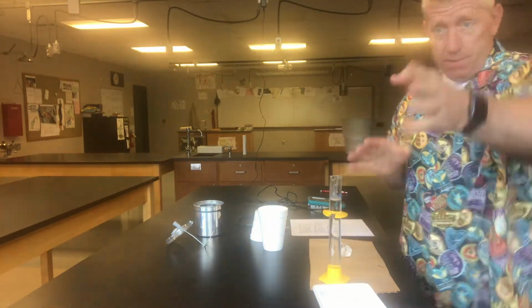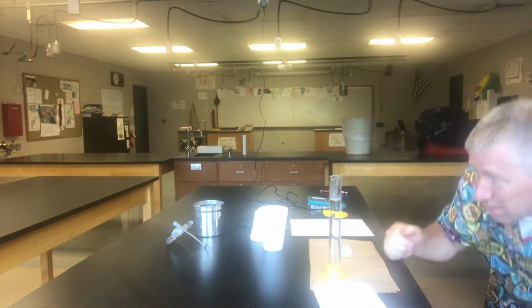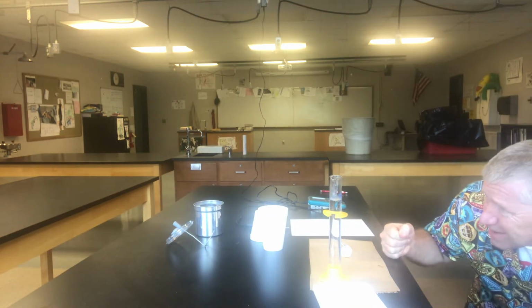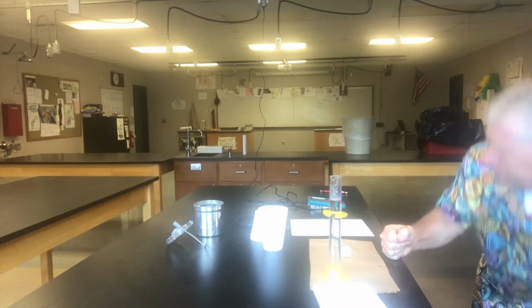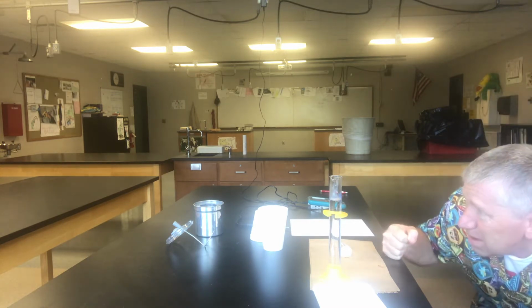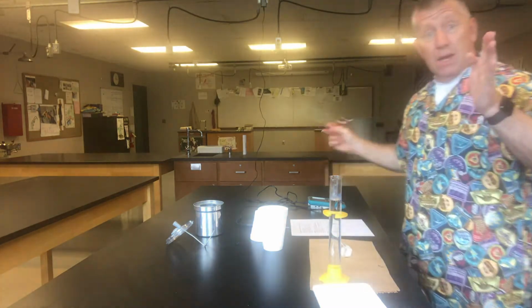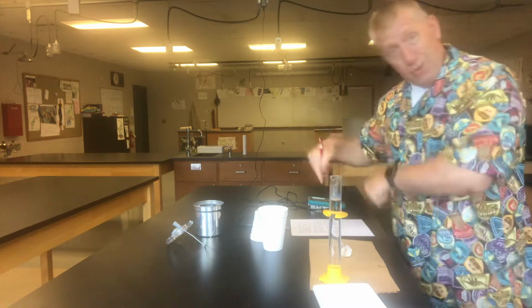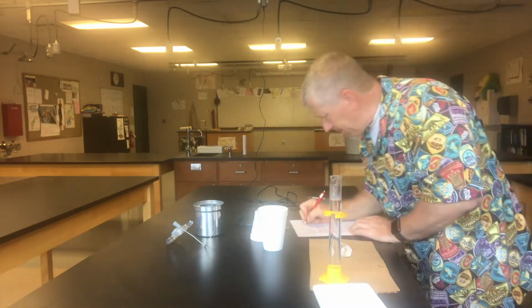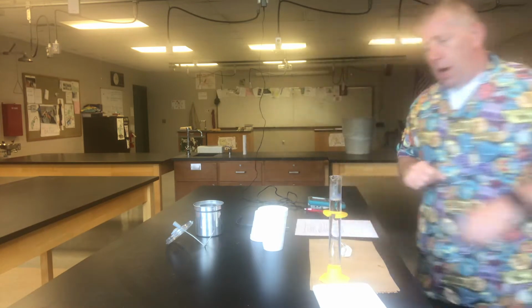Okay, so I've taken some of the hot water and we put it into the graduated cylinder. Meniscus reading, remember that? We are at 99.2. No, I'm going 99.3 on that. So that is the mass of the hot water, because remember, 1 milliliter goes to 1 gram. Just write that down in your paper. Okay, come on, lab partner, help me out. 99.3 grams of the hot water.